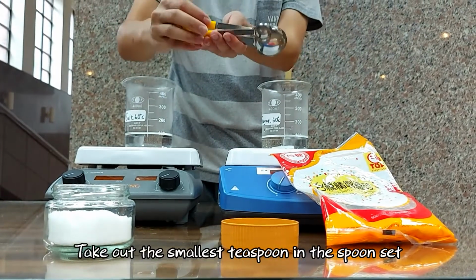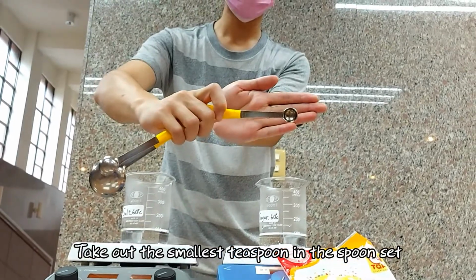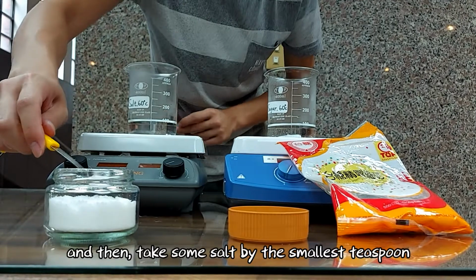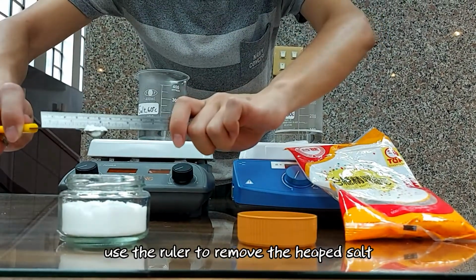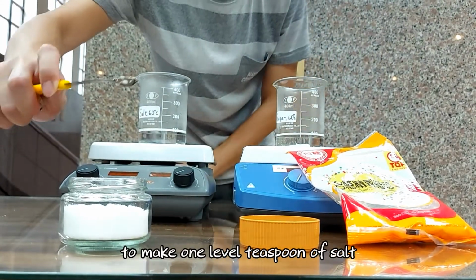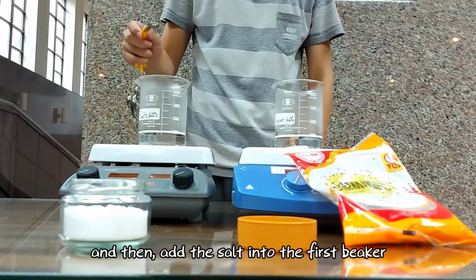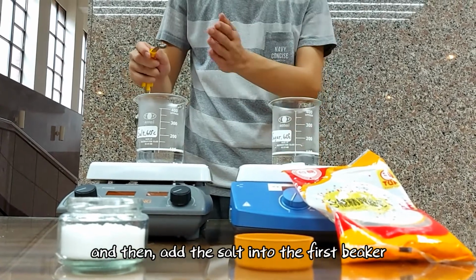Take out the smallest teaspoon in the spoon set. And then, take some salt by the smallest teaspoon. Use the ruler to remove the heaped salt to make one level teaspoon of salt. And then, add the salt into the first beaker.